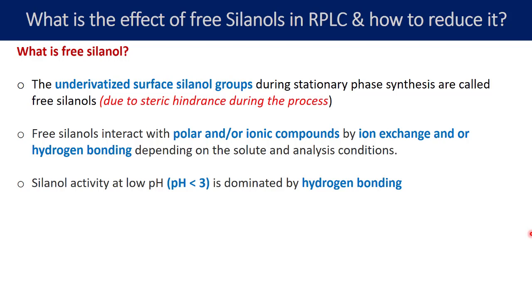Why do silanol groups not undergo ionization at lower pH? Looking at Type B silica, which is mostly used for column manufacturing today, it has a pKa value of around 5. Silanol groups are acidic in nature. Using the Henderson-Hasselbalch equation, you can calculate the percent ionization at different pH values. If pKa is 5 and pH is 5, 50% ionization takes place. The moment you adjust the mobile phase pH to pKa minus 2 — which becomes 3 or less — almost all silanol groups remain unionized.